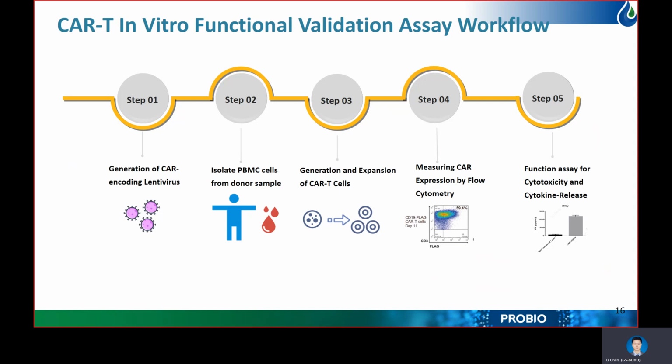Here I'm showing a general workflow of CAR-T functional validation using in vitro cell-based system. CAR-T cells are generated by isolating PBMC from human donor and transfection with CAR encoding lentivirus. CAR expression level is confirmed by flow, followed by cell-based assays to validate functional efficacies.